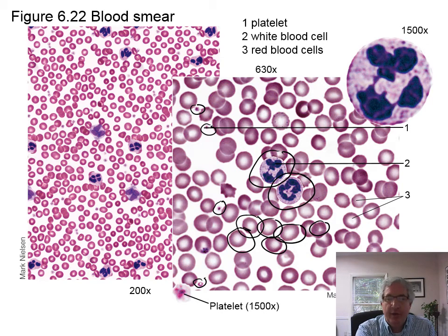Well, why is that? A cell normally has a nucleus in it. Here's a cell with a nucleus, roughly round shaped. When it loses the nucleus, you have that. If you look at the cell with the nucleus from the side, it's still kind of round looking.